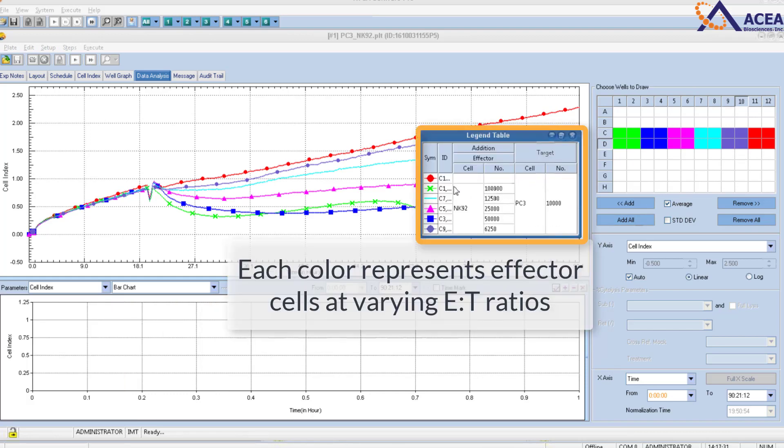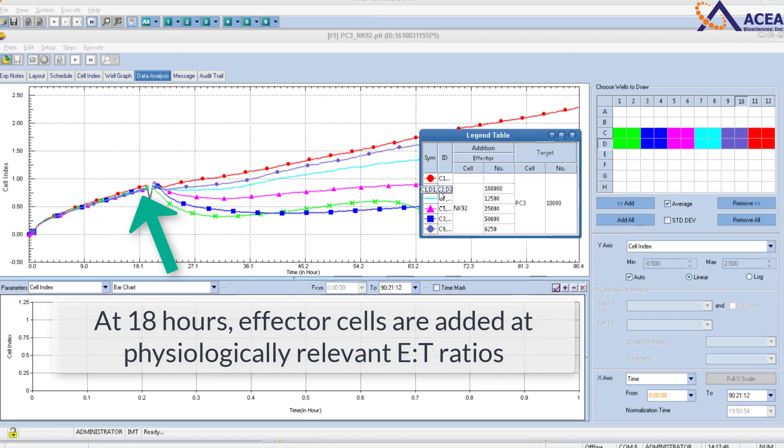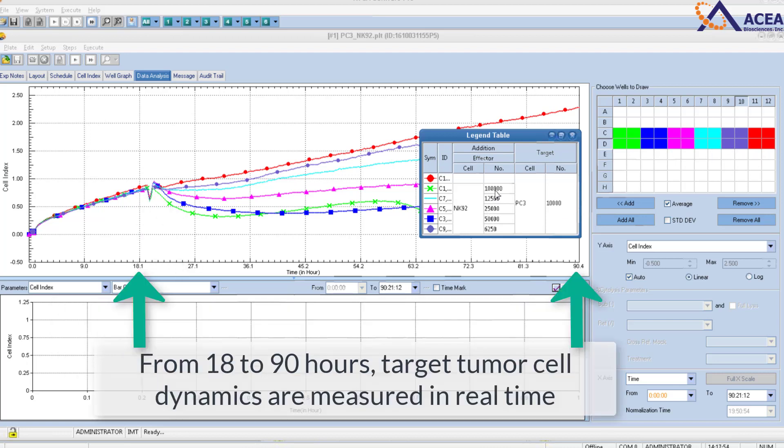In this graph, each color represents effector cells at varying E to T ratios. At 0 hours, target tumor cells are plated. At 18 hours, effector cells are added at physiologically relevant E to T ratios. From 18 to 90 hours, target tumor cell dynamics are measured in real time.